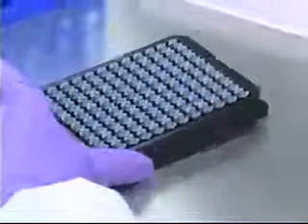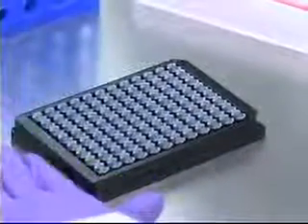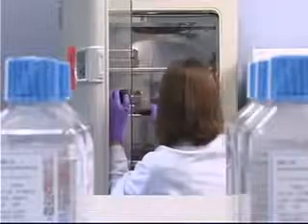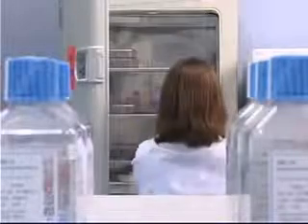Lightly tap the plate on your work surface to evenly distribute the well contents. At this point, cells can be labeled with a fluorescent reagent or express fluorescence via the green fluorescent protein. Incubate the cells overnight to allow for adherence to the well surface.